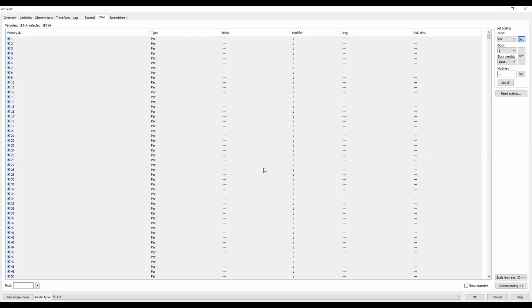So it's just going to change the existing one. Because we want to do an OPLS-DA, OPLS-DA only allows Pareto and center scaling. You will not be able to plot an S-plot, for instance, if you have UV scaling. So Pareto scaling is usually used.